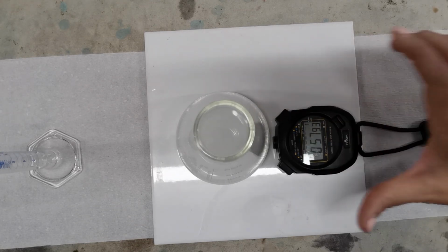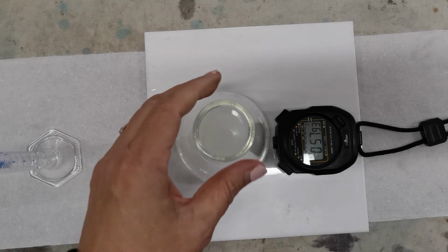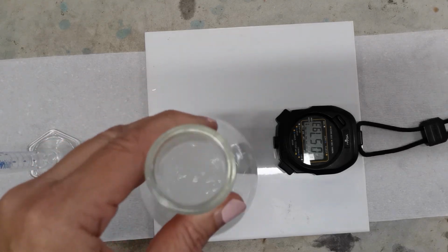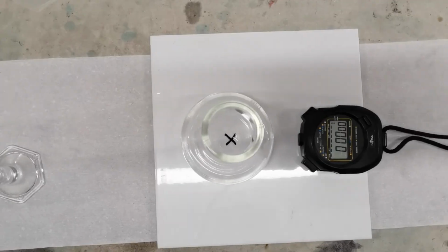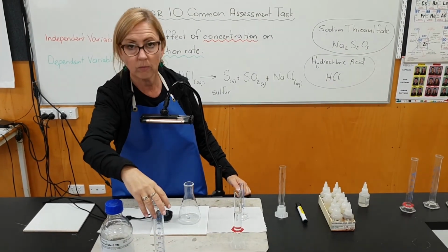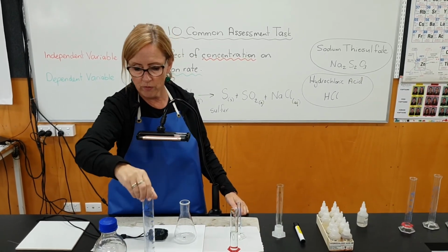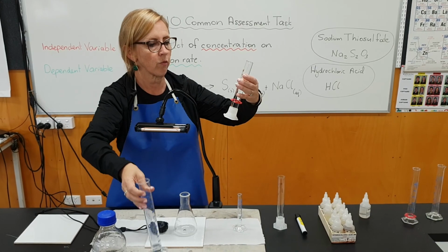And can't. All right, that's 57 seconds, or 57.93. So that's our second last reaction. Okay, we're on to our last reaction for this experiment. We have our 10 mils of thiosulfate solution, and we are going to add 40 mils of water.